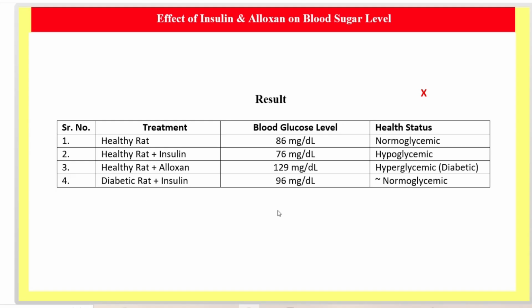So this was all the experiment comparisons. What is the effect of the drug, we can easily analyze by this table.